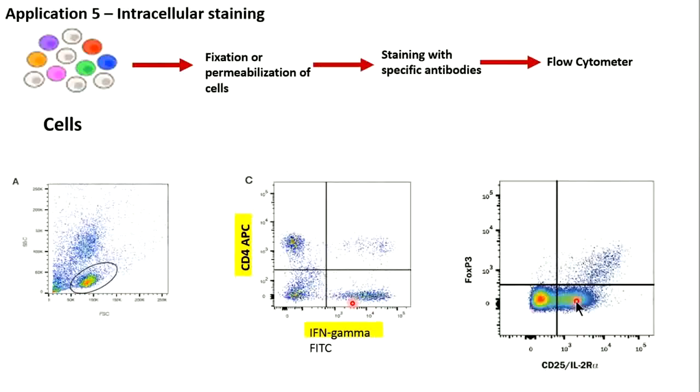Now, intracellular staining. So till now I have told you that you can add antibodies which bind to your surface proteins.